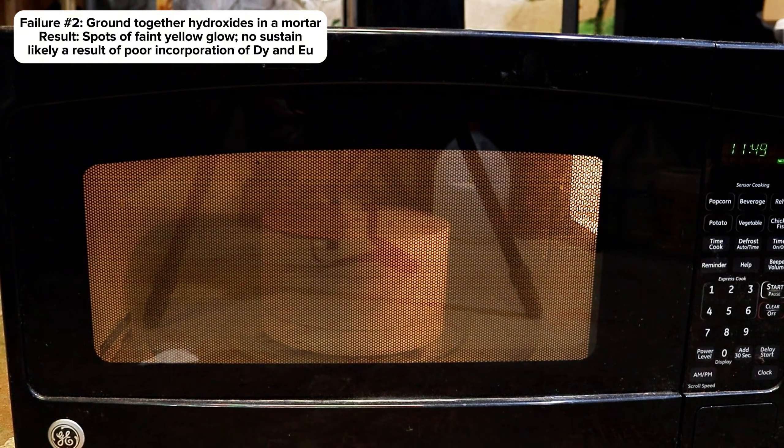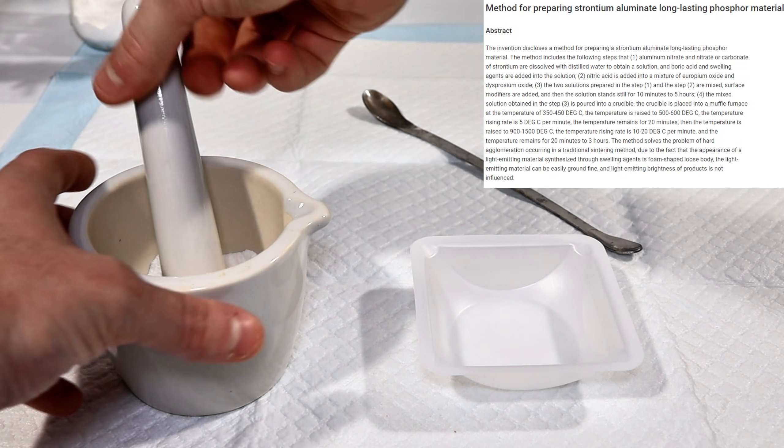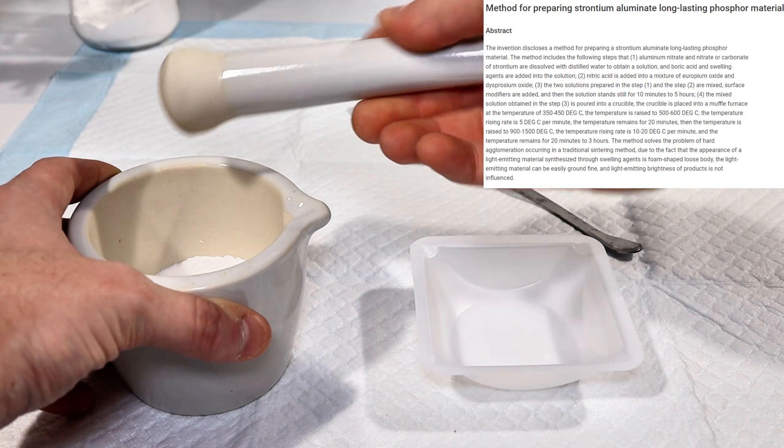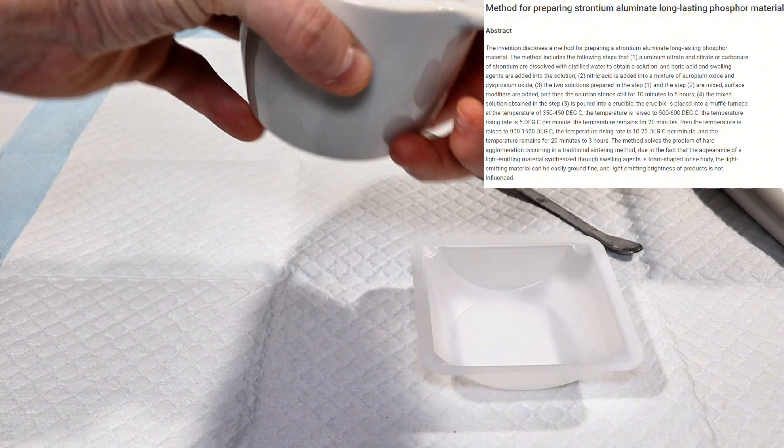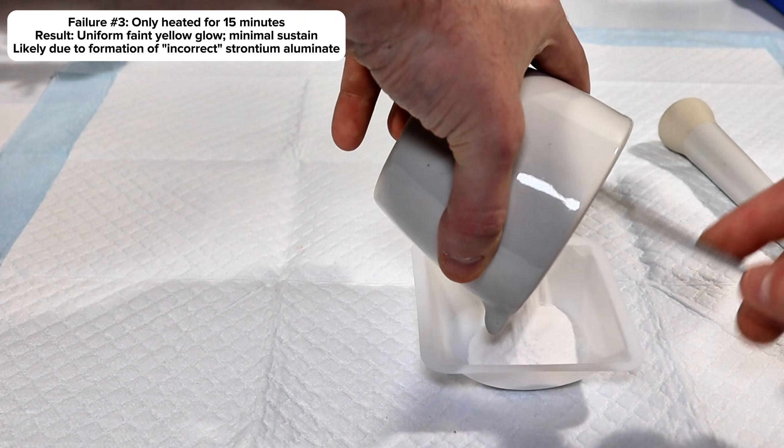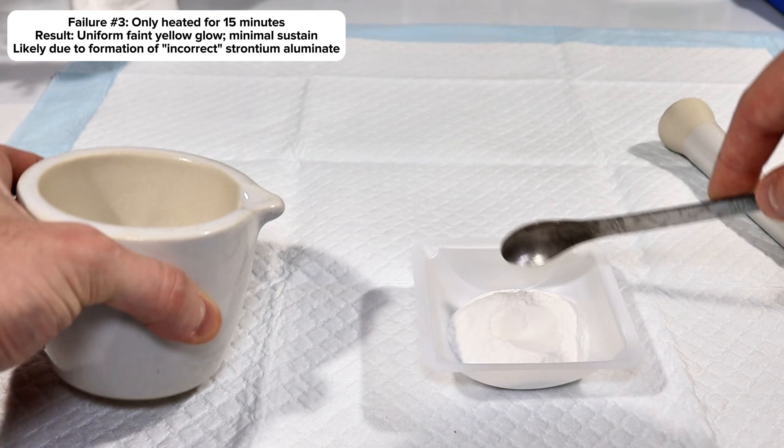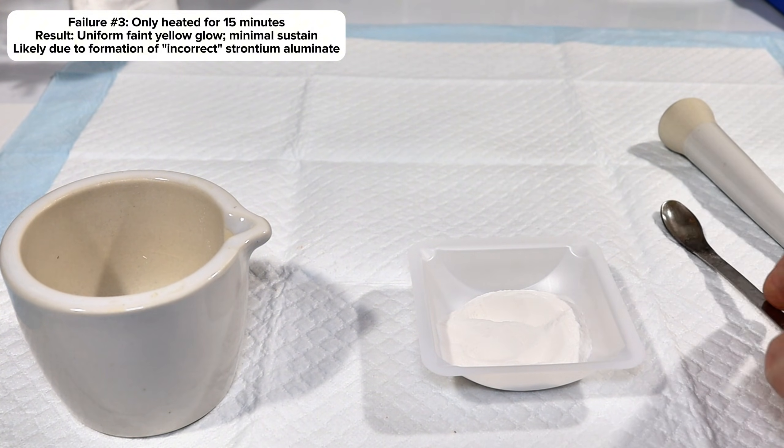This led me to eventually find a patent which described the production of strontium aluminate by the decomposition of nitrate salts, which is the method I show in the video. My third and final failure was essentially doing everything exactly as I've shown, but firing the salt mass for the previously mentioned 15 minutes rather than the 30 minutes I used for my successful run.